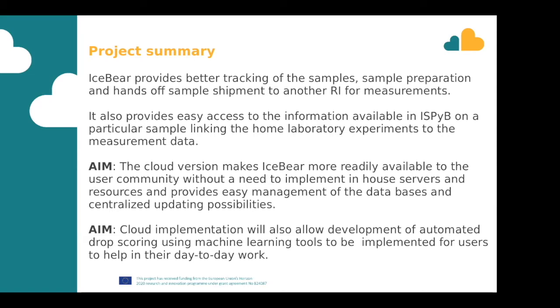And additionally, we want to communicate with other research infrastructures and the databases and what sample information and experimental information they have. In this case, it's synchrotron facilities where we collect the data either on site or remotely or automated data collection and so on. We want to build this link so that the sample information metadata is transferred back and forth, not essentially copied, but made accessible through links to different databases and so on. Some of the data is actually copied, but the critical ones only.